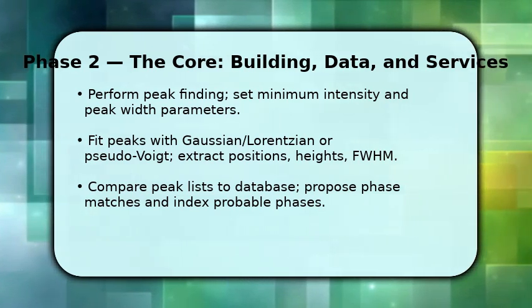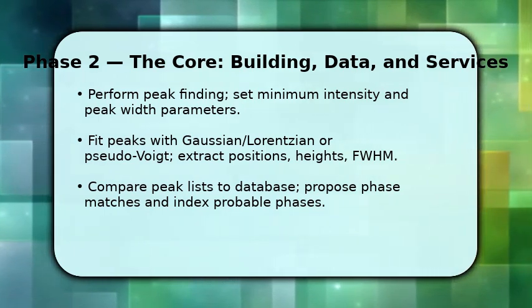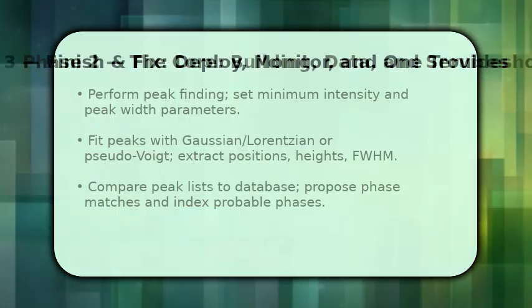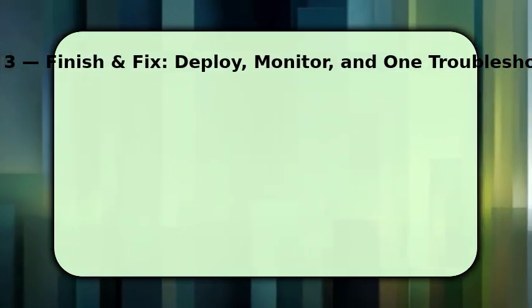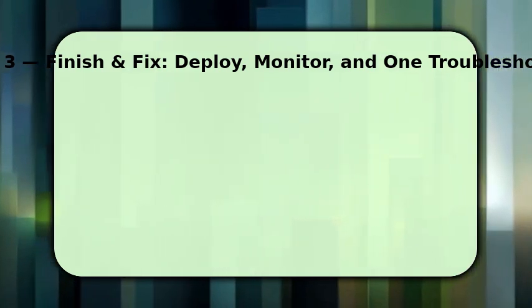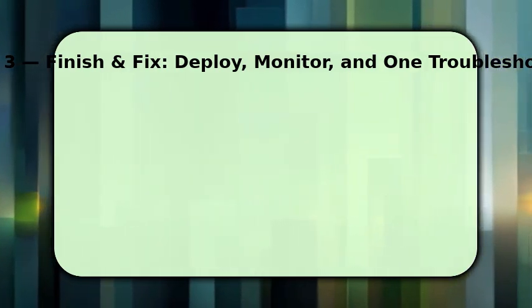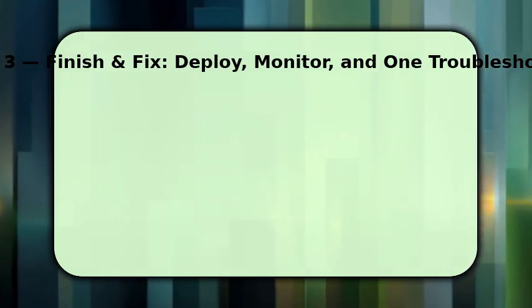You finish by refining the whole pattern. Run Rietveld or full profile refinement and sequentially refine scale, lattice parameters, profile and background terms. Refine conservatively to avoid correlations. Once converged, compute weight percentages with Rietveld outputs or RIR methods and report uncertainties, document assumptions.